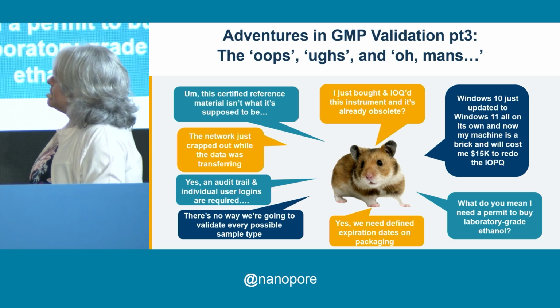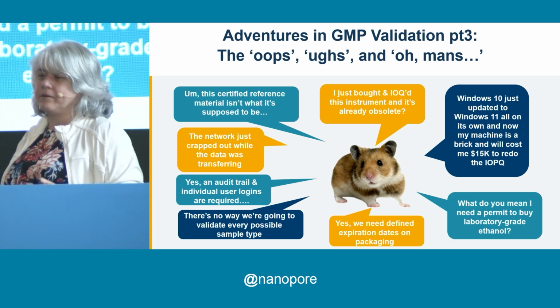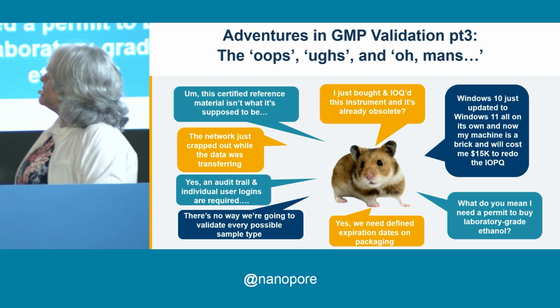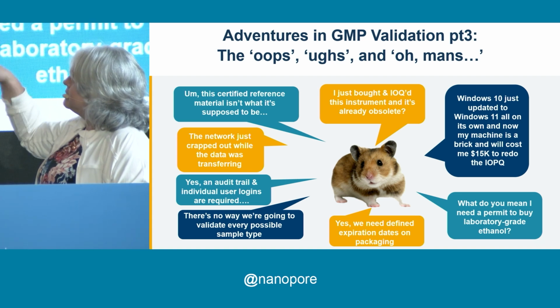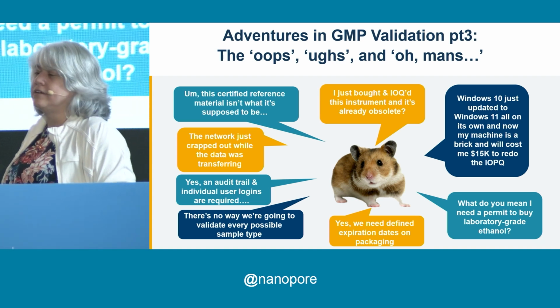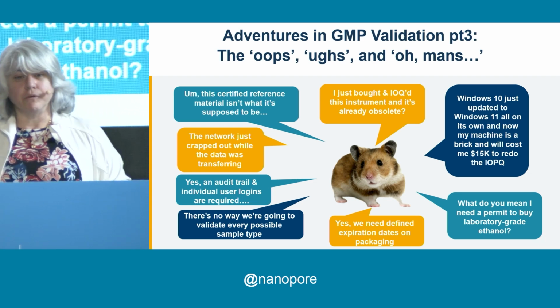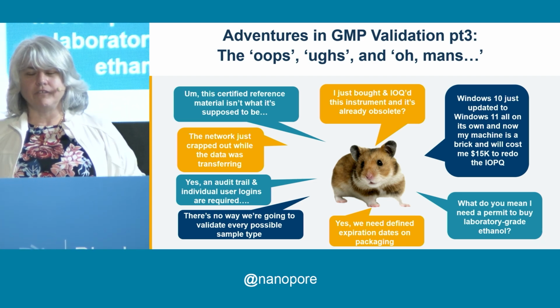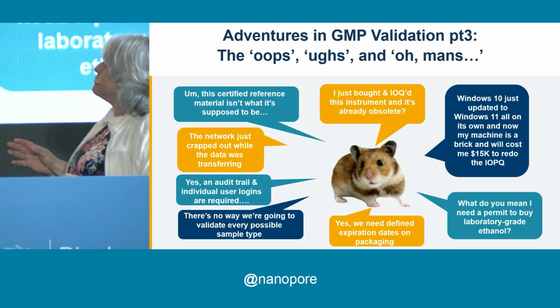So I want to go through this because this is the fun part. Things you don't think about that always happen, and I've done this enough times to see it. First of all, be careful of your certified reference material. We've had instances where it wasn't what it was supposed to be from a vendor. This is certified reference material. They did not properly certify it. It was something completely different.